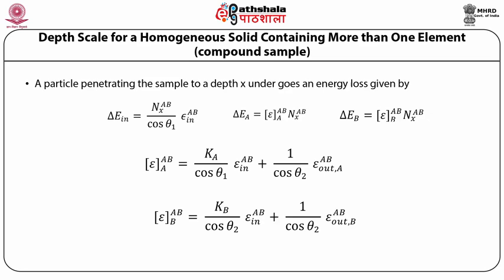Since the stopping cross-section varies with energy, the energy that the particles lose along identical outward tracks also depends on the atom struck in the scattering collision.